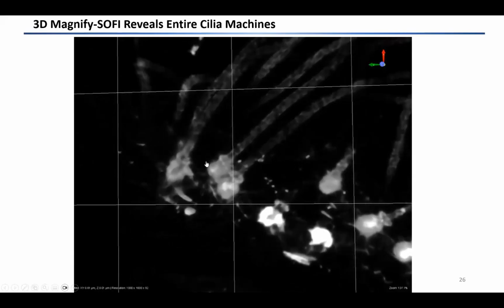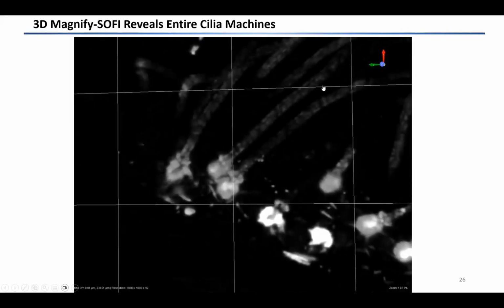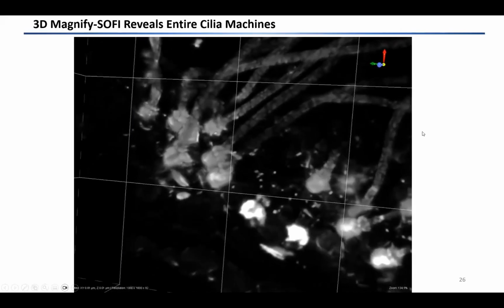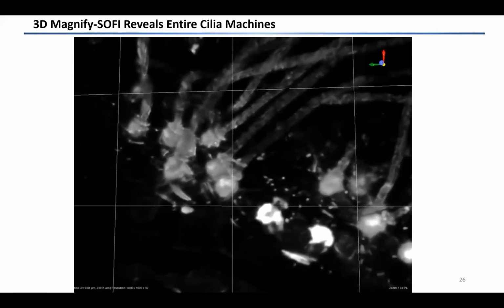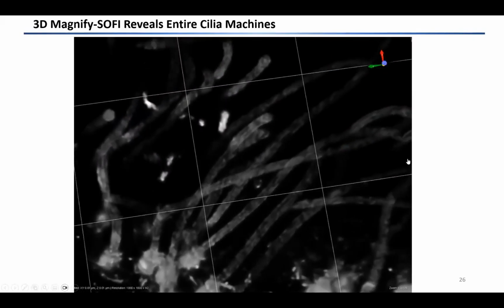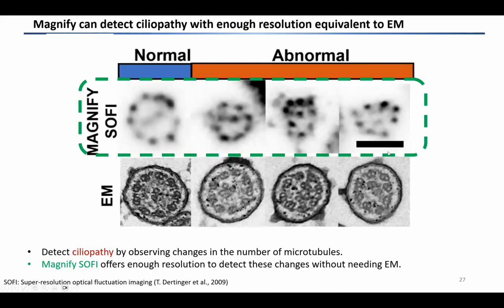Right? So you can see the basal bodies, like the appendage, as well as the intact ciliary structure in 3 dimensions. The whole process only lasts for 1 hour, compared to the serial block-face SEM technique, which would take you weeks, if not months, to acquire the same volume.